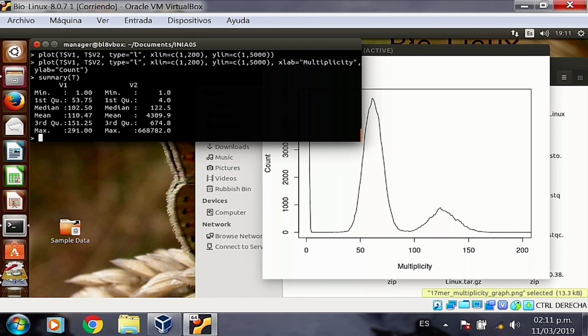First, choose your x-axis. You'll see that compared to my table, which has a maximum under 291, yours should have a maximum around 2,000 something, or maybe 3,000. Is that correct? So everybody was able to take a better look at your data with that summary table. I've seen that some people here have done a different kind of counting and a different kind of filtering. Some of you only have one. Okay, guys, if you're already here, are we already here? Please, we need to move forward fast, right?